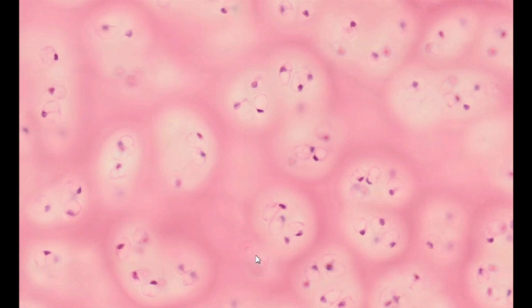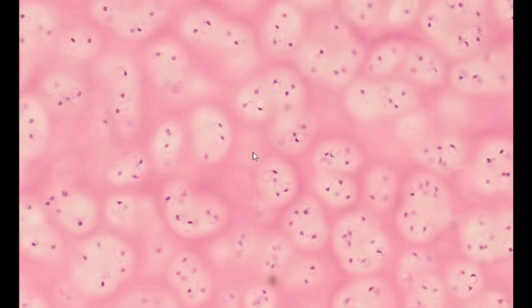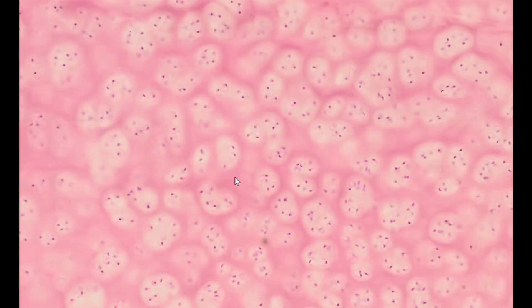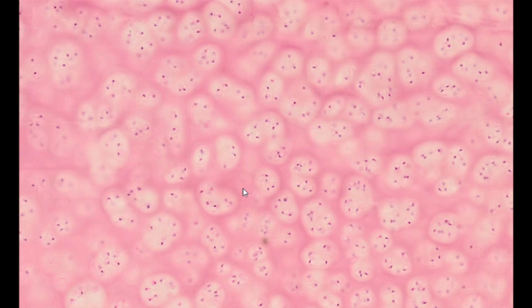The matrix of hyaline cartilage in H&E stained specimens appears amorphous, translucent, with an almost uniform structure. This is due to the presence of a large amount of chondroitin-sulfate-rich ground substance and a relatively small amount of type 2 collagen. This type of collagen creates a net-like plexiform immersed in the ground substance of the cartilage.